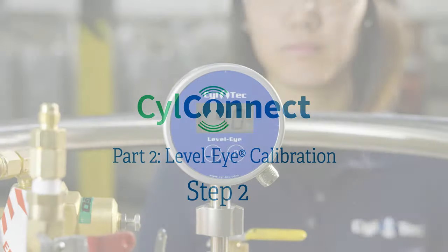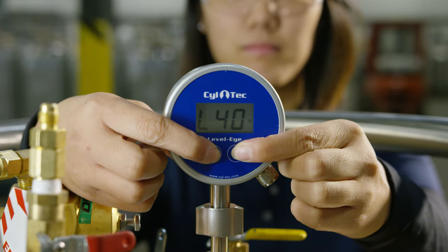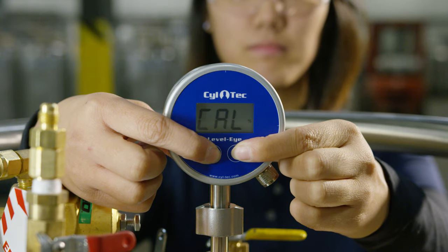Step two: hold the L and R buttons together for five seconds to enter calibration mode. The word CAL will be displayed on the screen.